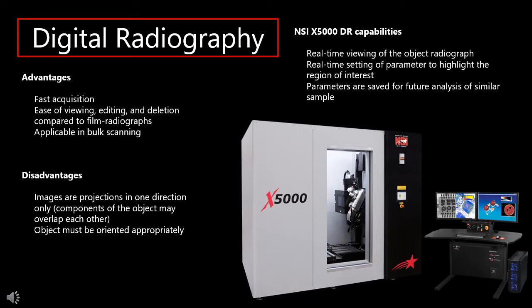So for some disadvantages, the images are projections in one direction only, or in one orientation of the sample, which means that if some of the components of the object overlap each other, it may erase some details or make some parts blurry. So this means that the image must be oriented properly with respect to what we have to investigate in the sample.